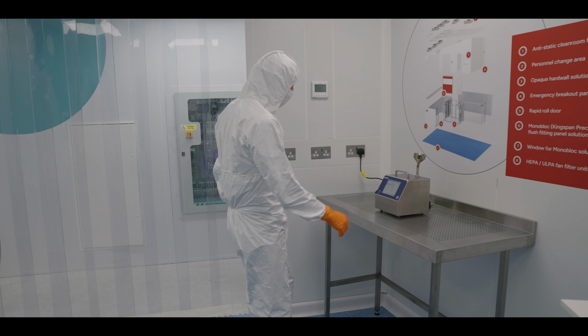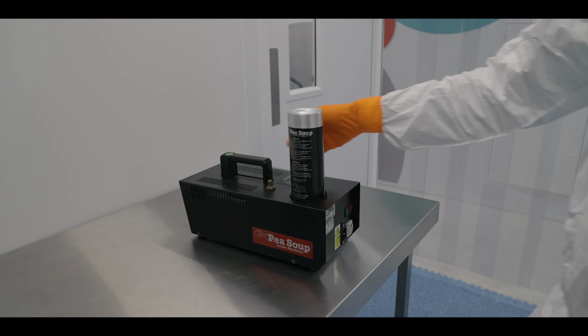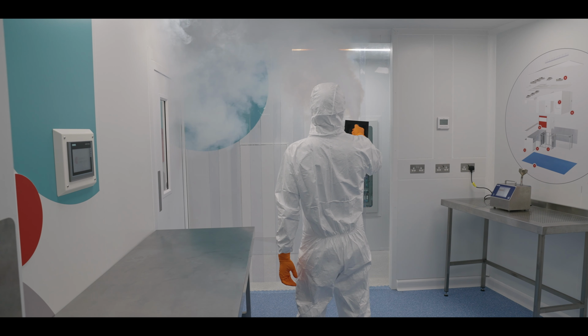In this test we're going to be looking at recovery rate testing. Recovery rate testing assesses how quickly a cleanroom can return to its specified cleanliness levels after a brief period of induced contamination, such as personnel or materials entering the cleanroom. In order to complete this test we use a pea-soup fogger and particle counter.